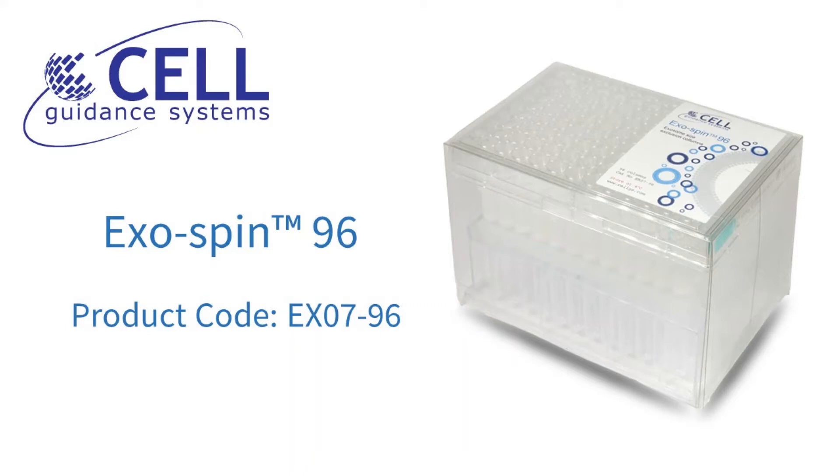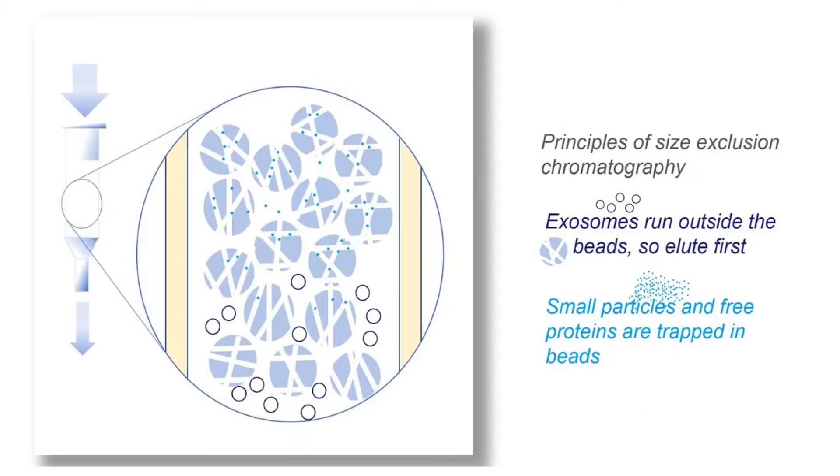In this video, we'd like to introduce you to Cell Guidance Systems' ExoSpin 96 Kit. This product is designed to streamline, simplify and scale up efficient purification of exosome samples from large numbers of biological samples, such as serum or plasma, in a standard 96-well format. The kit utilizes size exclusion chromatography, or SEC, which retains smaller molecules such as free proteins. These components of the samples are absorbed by resin beads, allowing the larger exosomes to elute first. This provides a simple, rapid purification process.